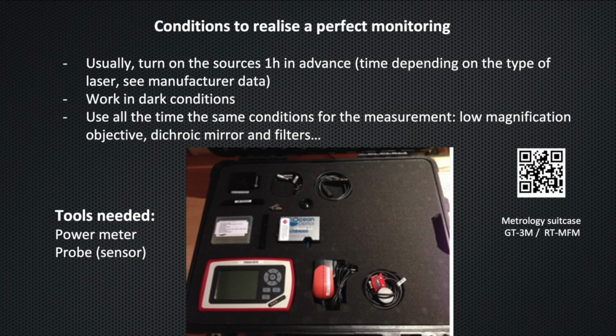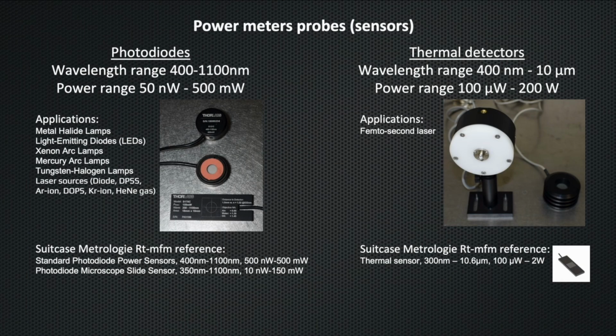These measurement tools are available among many others in the Metrologie suitcase, made available by the GT3M of the RTMFM, the French microscopy technological network. Different types of probes exist depending on the power of your source to measure. Two types are often used.